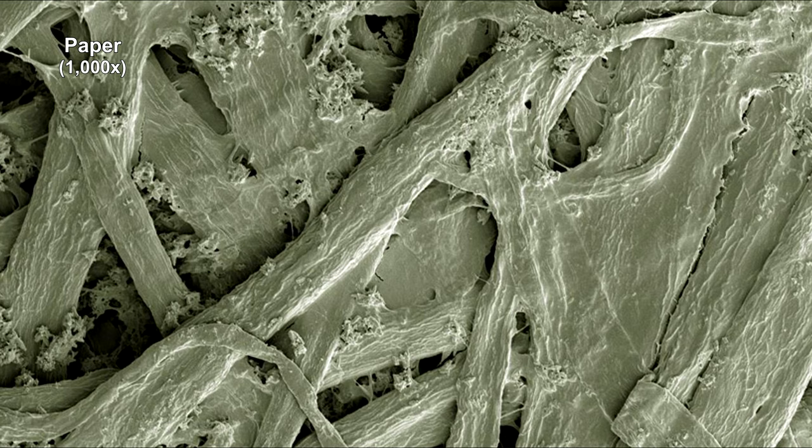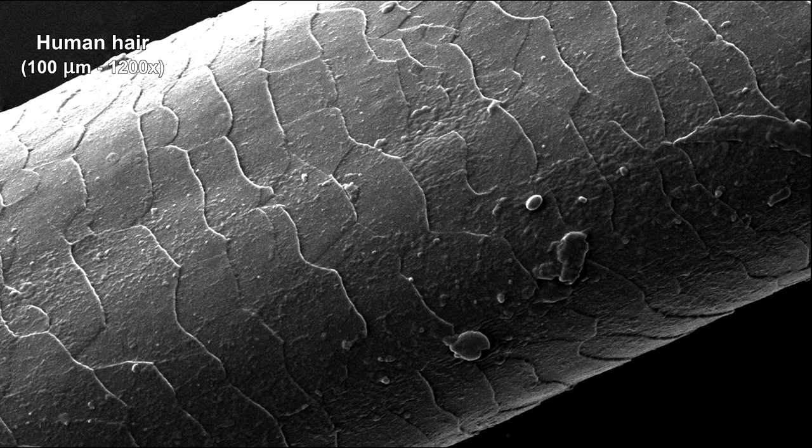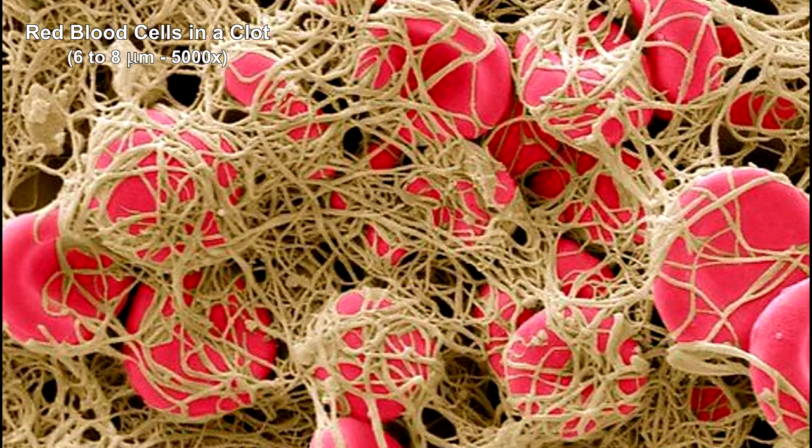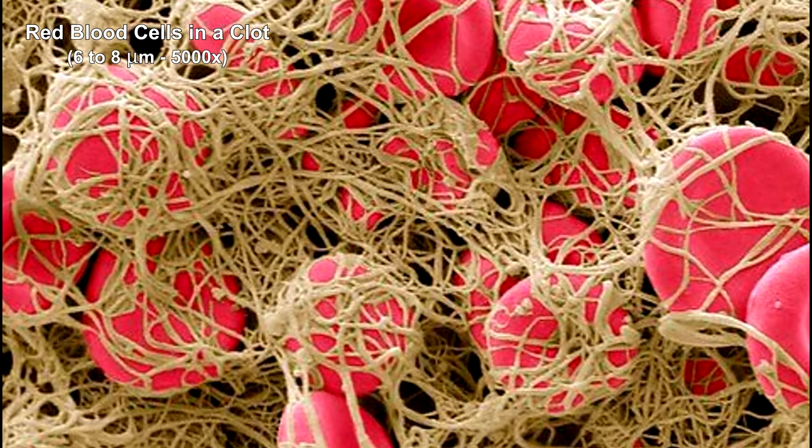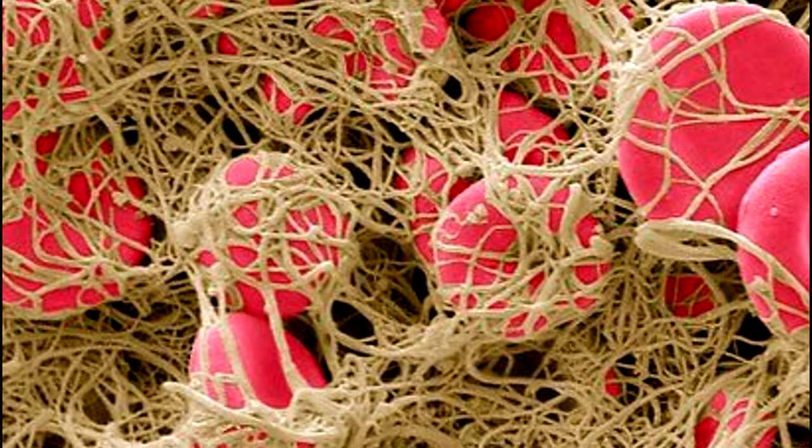Here's what a sheet of paper looks like at 1,000 magnification. Here's a human hair magnified 1,200 times. This is a micrograph of red blood cells clumped together with fibrin to form a blood clot.